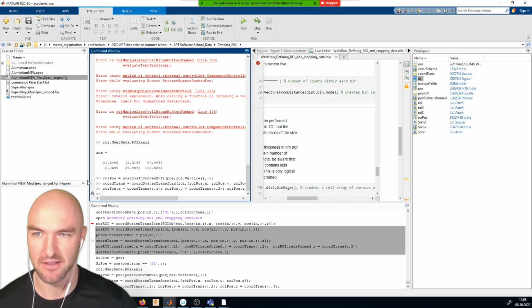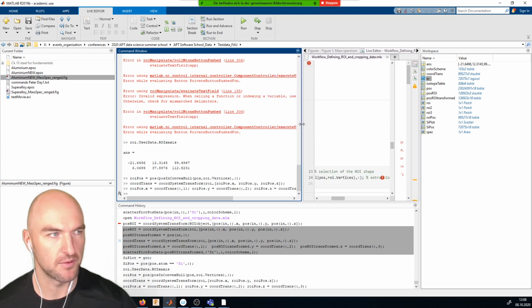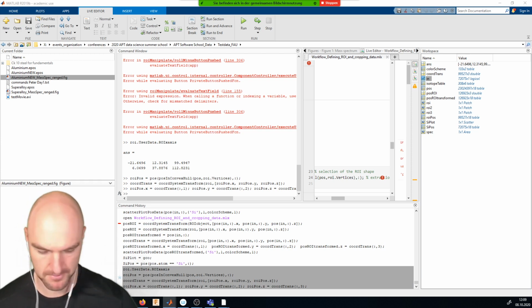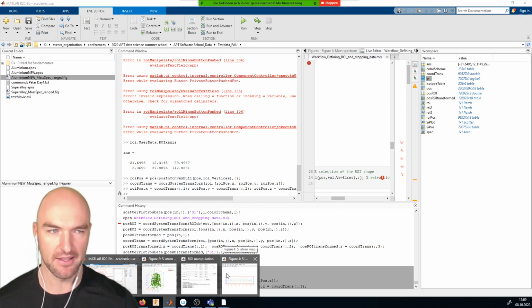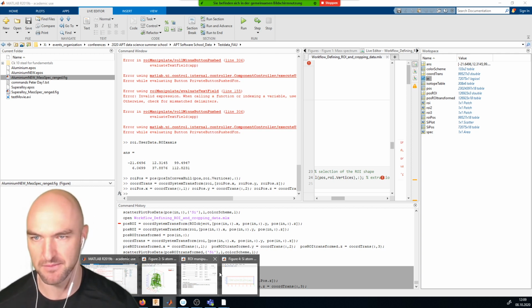And I can see that this may be still not optimal for you to see everything. And I will just make that a little bit wider. And now we've got the fully coordinate transformed ROI pos for all of the entries. And again, that sounded like it takes 5 minutes all of the time, but once you've done that once, it just autocompletes and it happens in seconds.